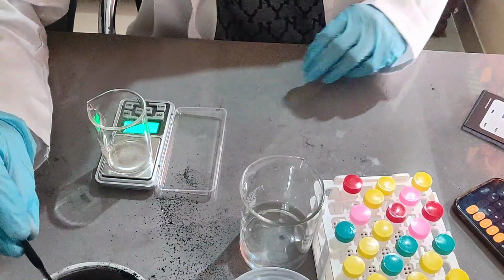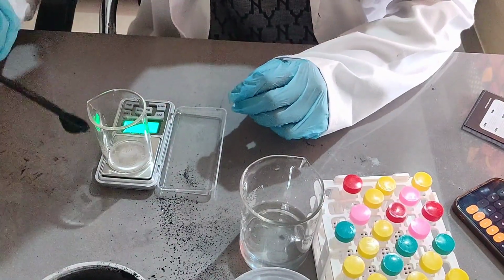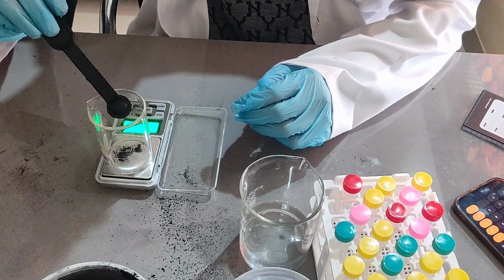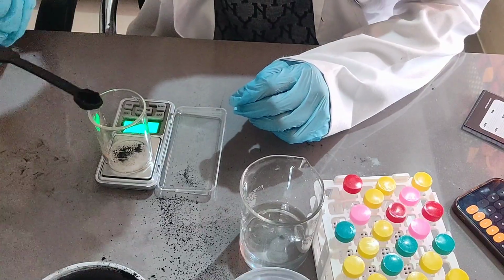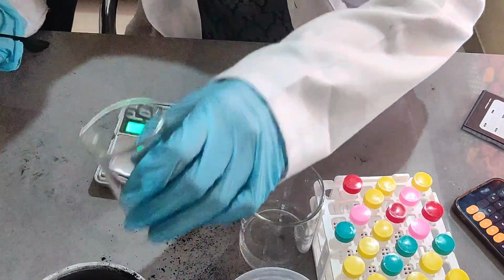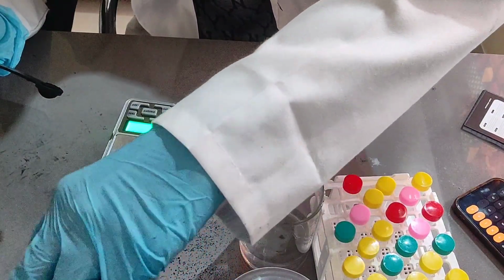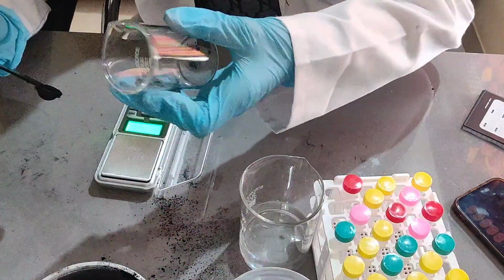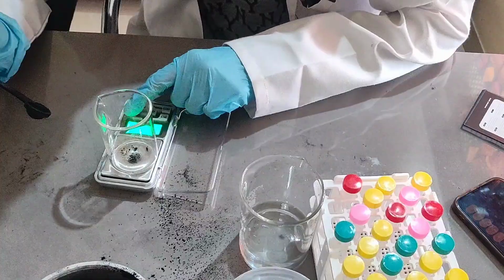Six, three. What is it? Okay, so as it didn't detect a change in weight for so long, it just turned itself off.